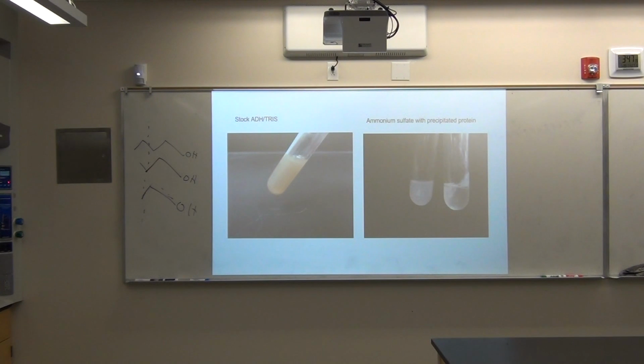So obviously there are limitations to trying to pulverize and mechanically lyse in a mortar and pestle. Is there a way to kill the yeast completely without chemicals? Probably not without damaging the components in there, one of which is our target molecules. It's not that big a deal to spin it down, though, given really the time and cost of that method versus the old method. There's still a whole lot that could go wrong before you would abandon this mechanical crushing, because it's such a finicky enzyme to begin with.